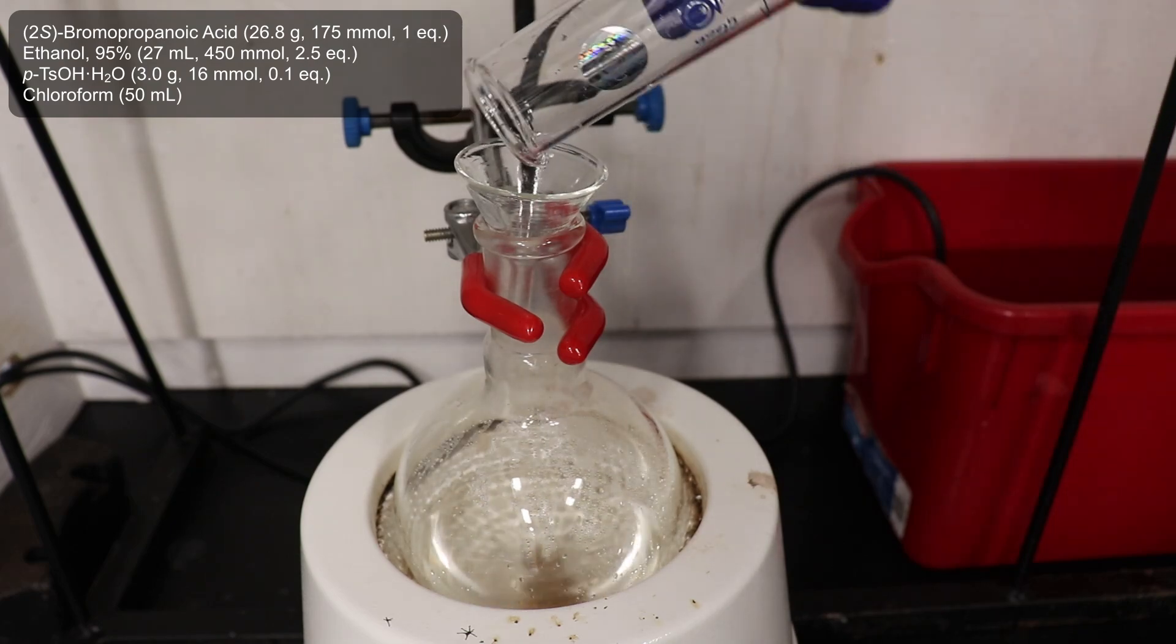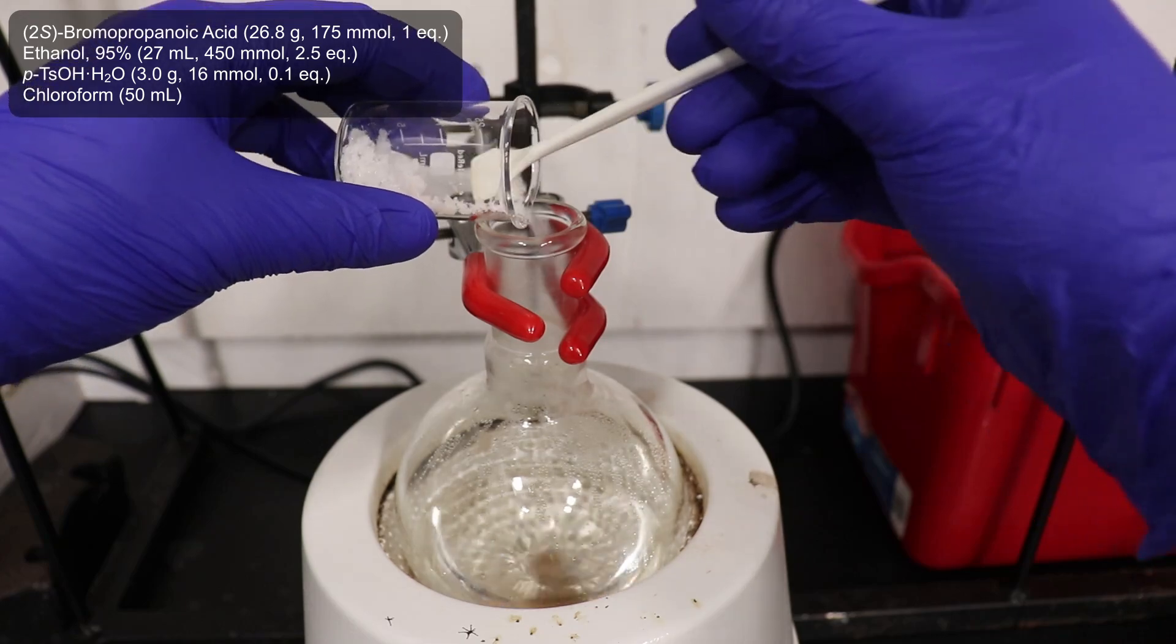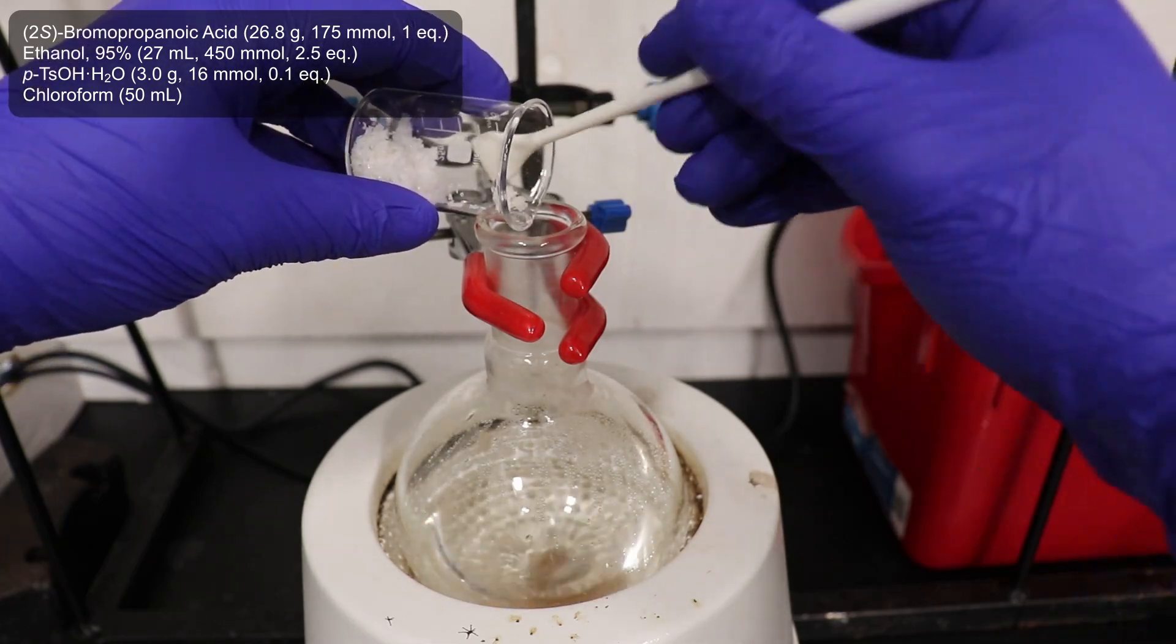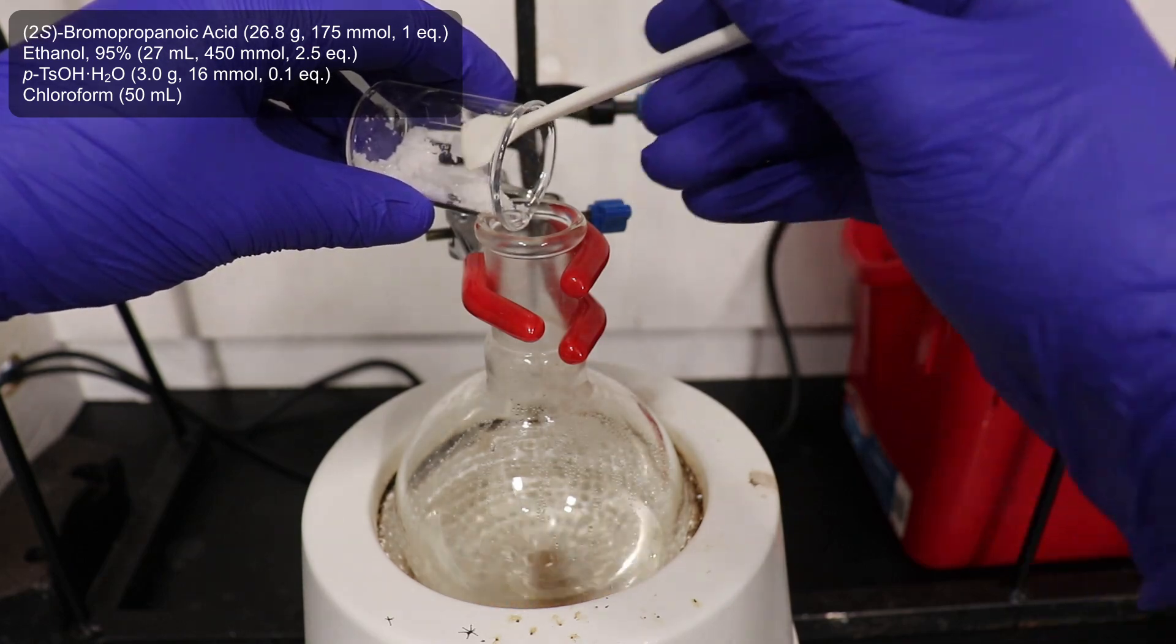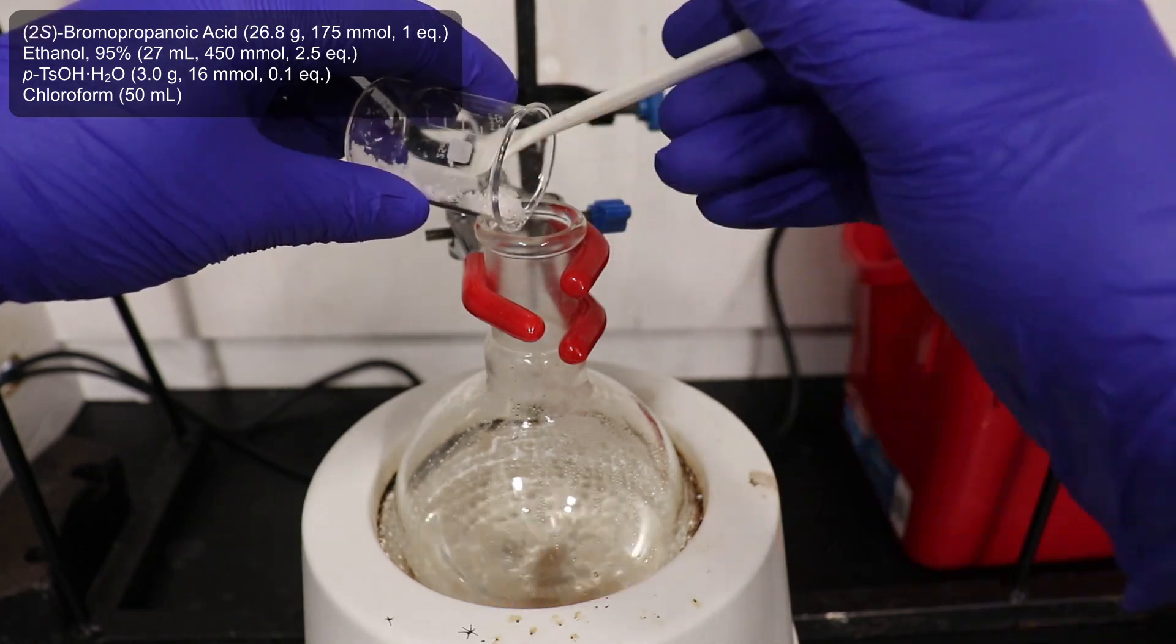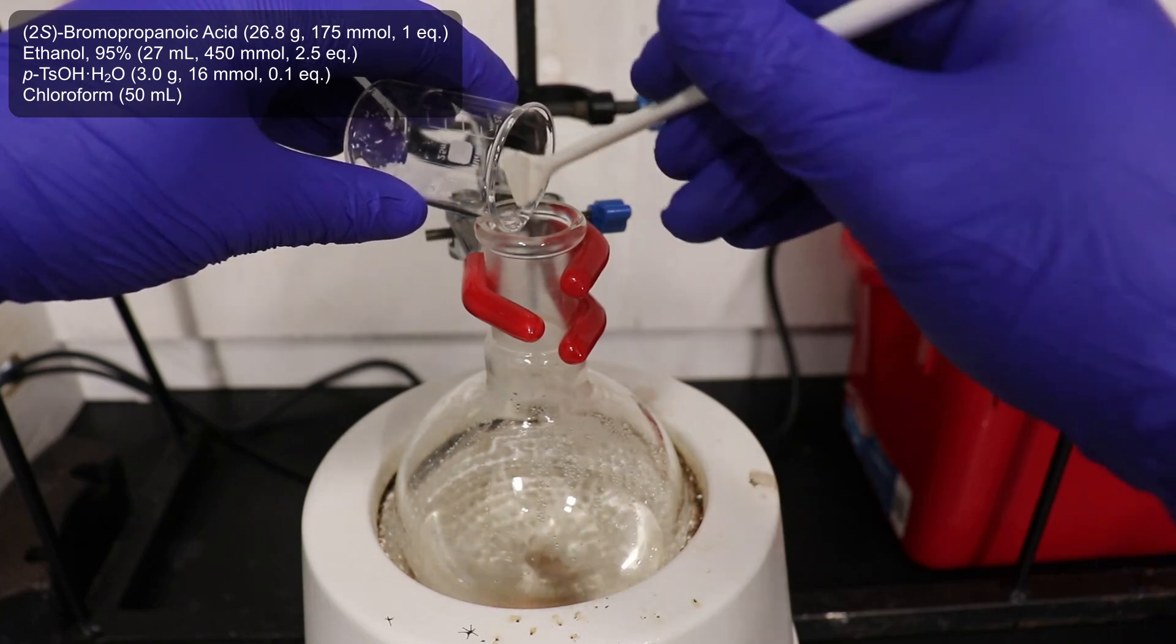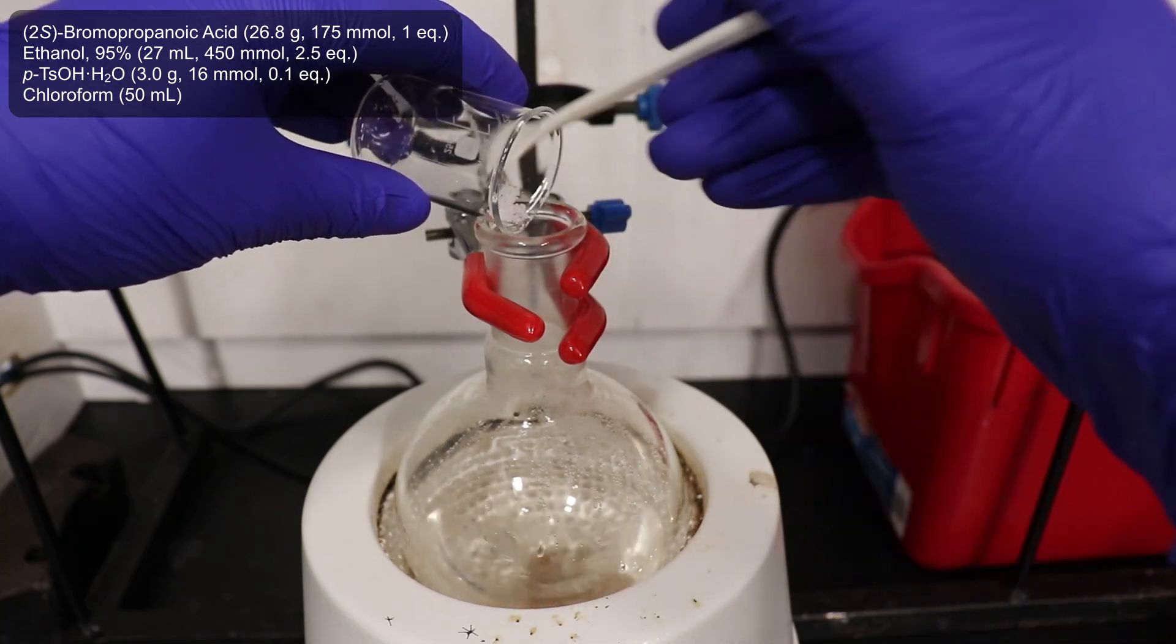27 mL of 95% ethanol, and 3 grams of para-toluenesulfonic acid monohydrate as our strong acid catalyst, which I had prepared myself 5 years earlier by the sulfonation of toluene.